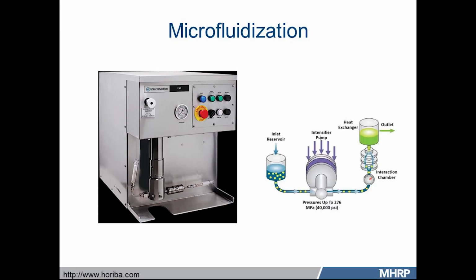So in this scheme is the inlet reservoir which contains colloidal particles, and then at high pressure they are broken down into a small homogeneous solution, which is a true solution here. This is a colored solution I'm showing you here, but for liposomes, when there is no dye in there, these are multilamellar MLVs in the aqueous solution. When you apply high pressure, these MLVs are broken down into small size vesicles, and this is a milky solution which becomes transparent.